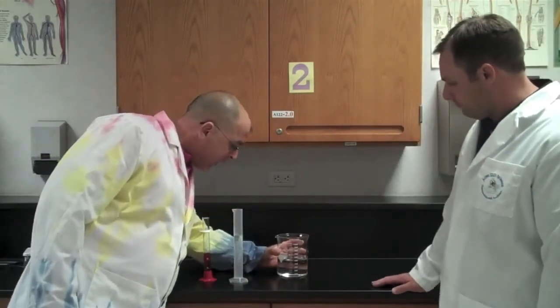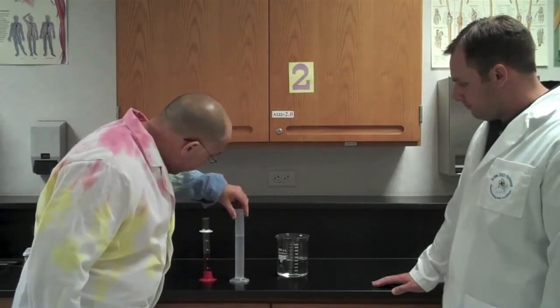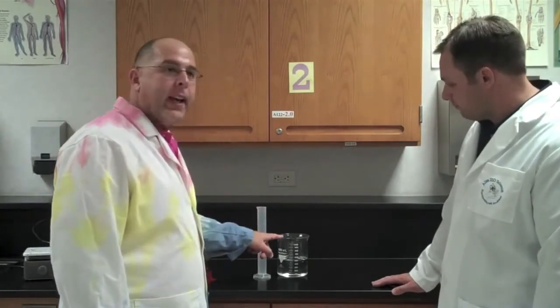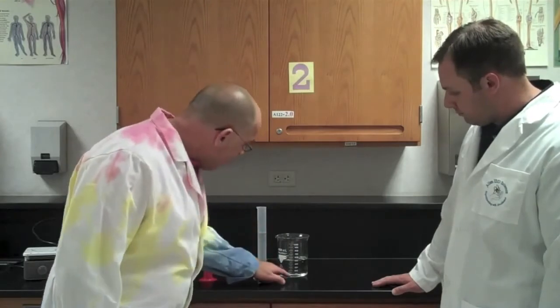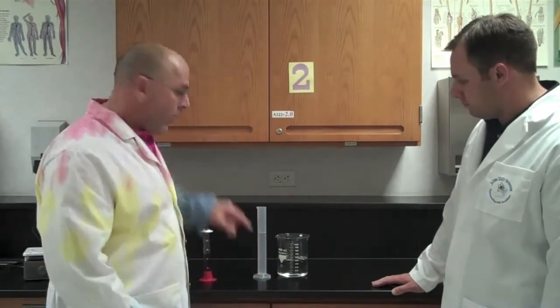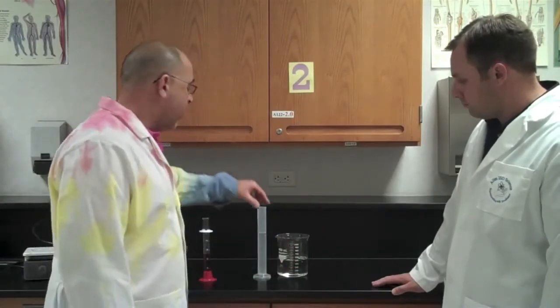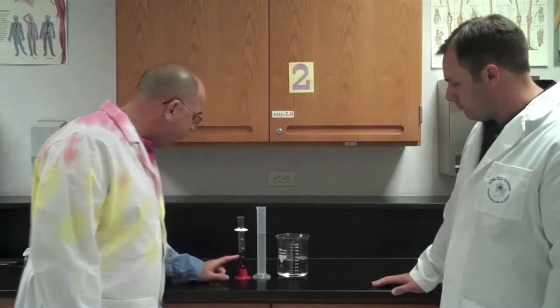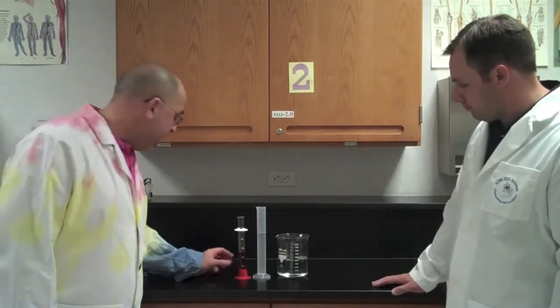A graduated cylinder is the most accurate way to measure. I'll give you an example here. This graduated cylinder goes up to 100 milliliters. Look how tall it is. It's way taller than the beaker. But 100 milliliters on this graduated cylinder is only to the first line on this beaker. So you can see the difference here. This measures larger liquid and not so accurate, whereas the graduated cylinder is the most accurate. This one we put a dye in so you can see it a little bit better.